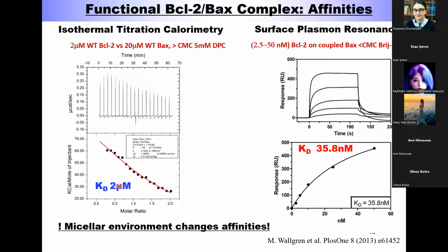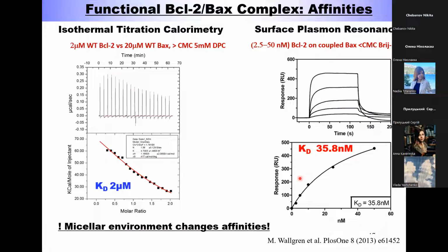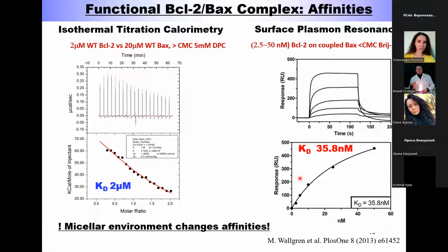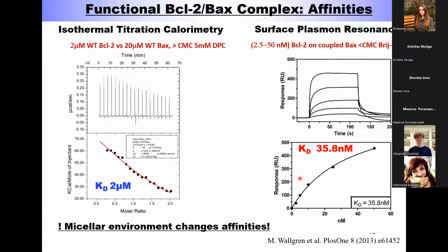We see it's binding, but it's clear if you look at the literature, it should go down to nanomolar. If you work with detergent, it's not really like if you work in a real membrane or solution. This detergent micelle bubble, they're protected partially, they have the same behavior, but the affinities are changed because the peptide also needs micelles, detergent, and then goes to a protein with detergent. So this affinity will not be the same as in the real world. But its behavior is the same.